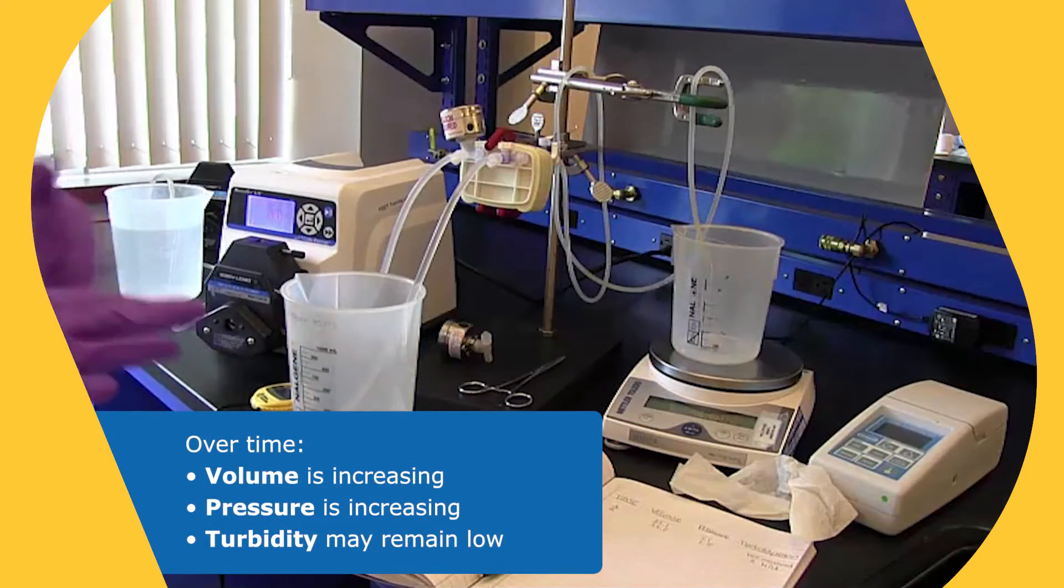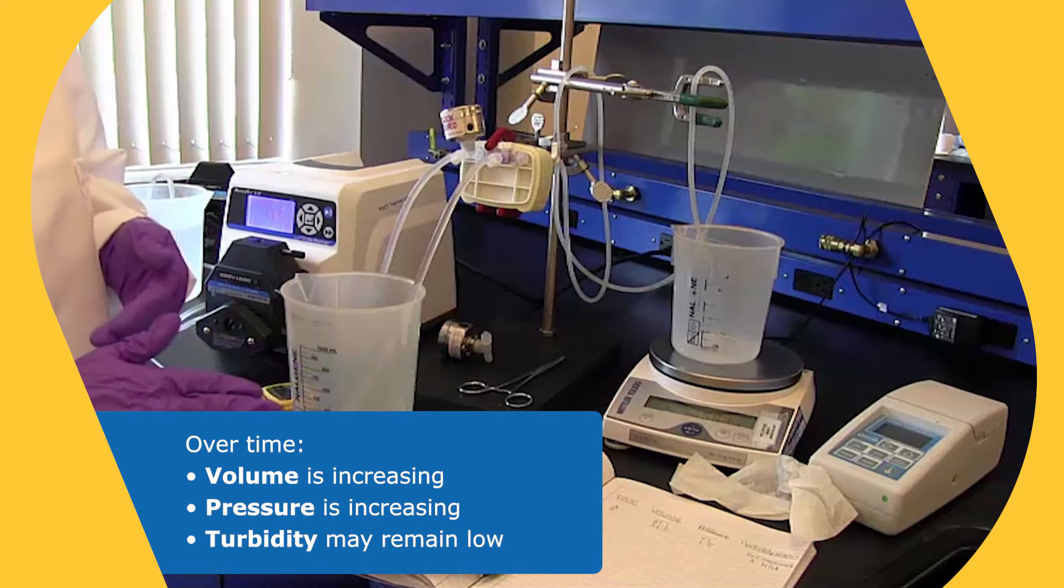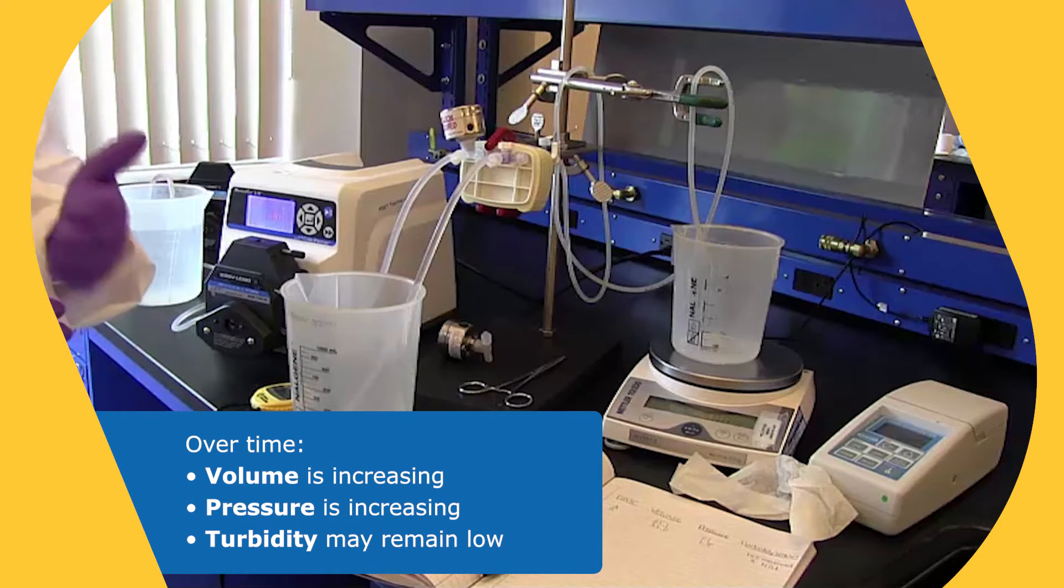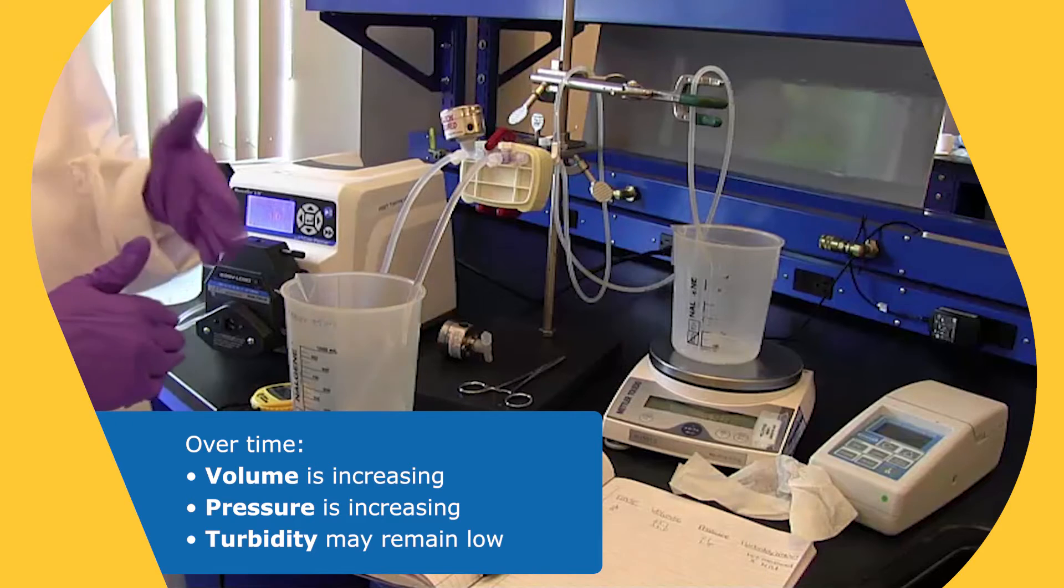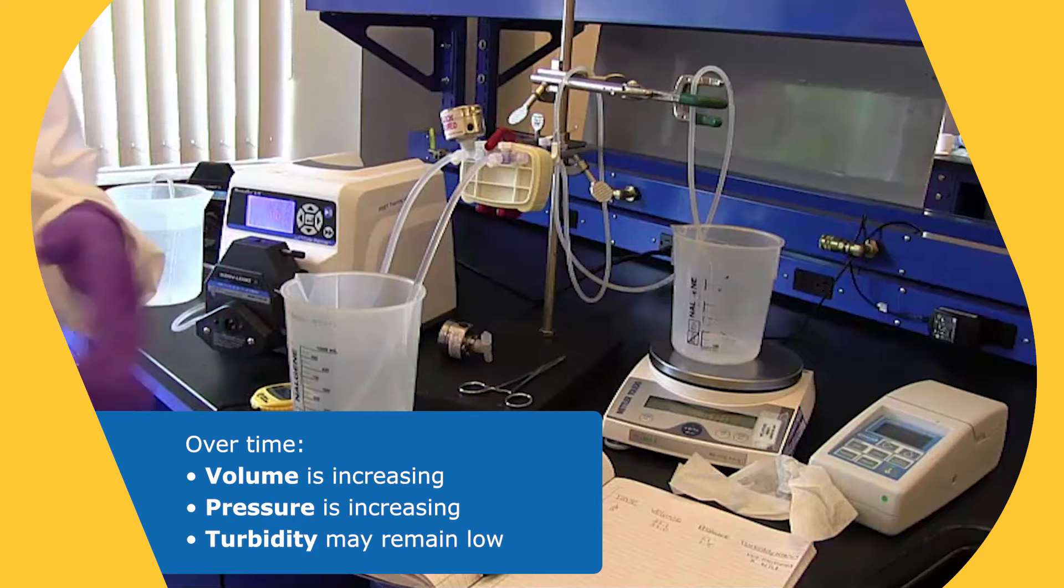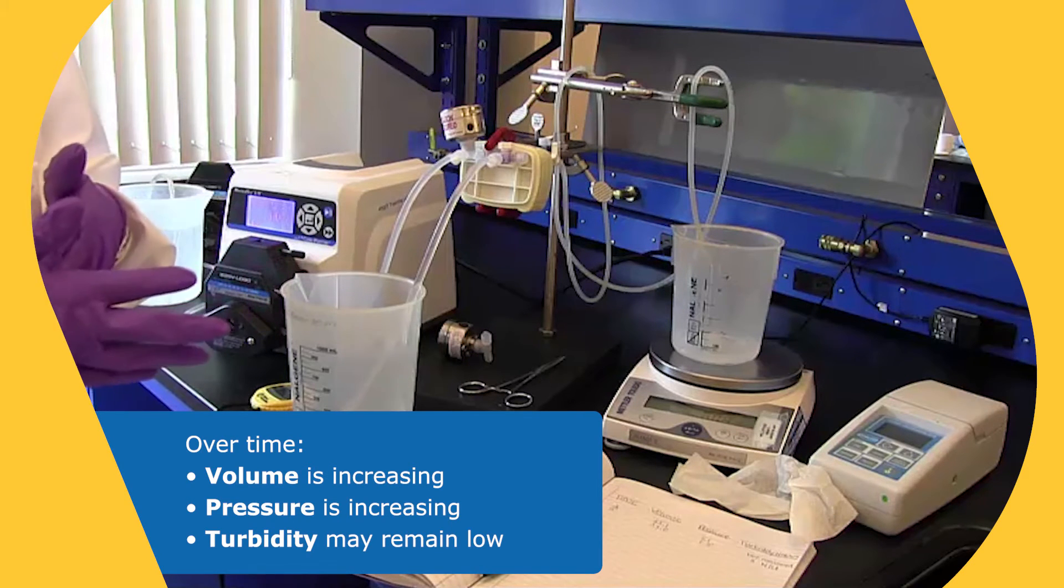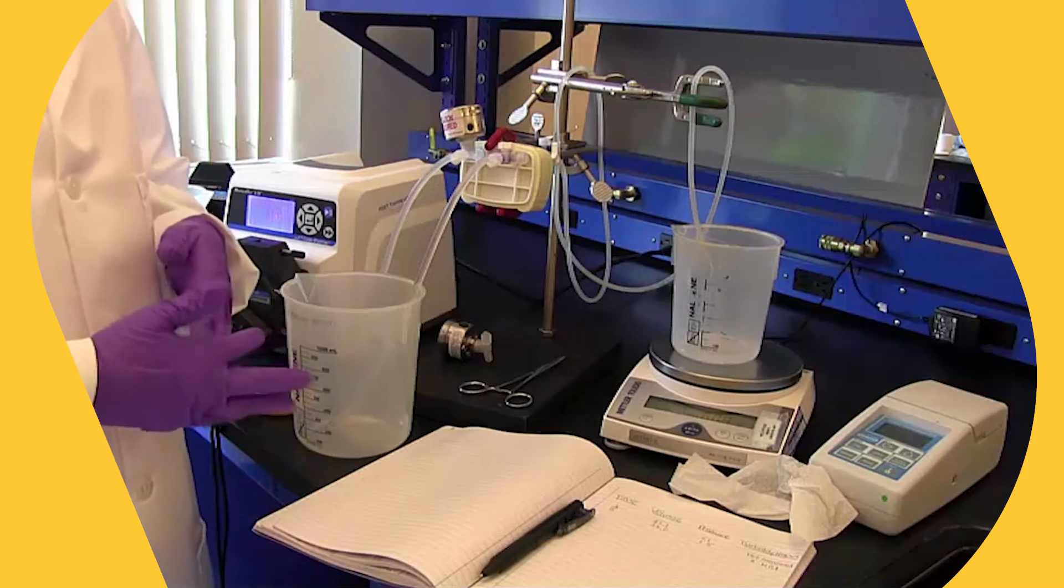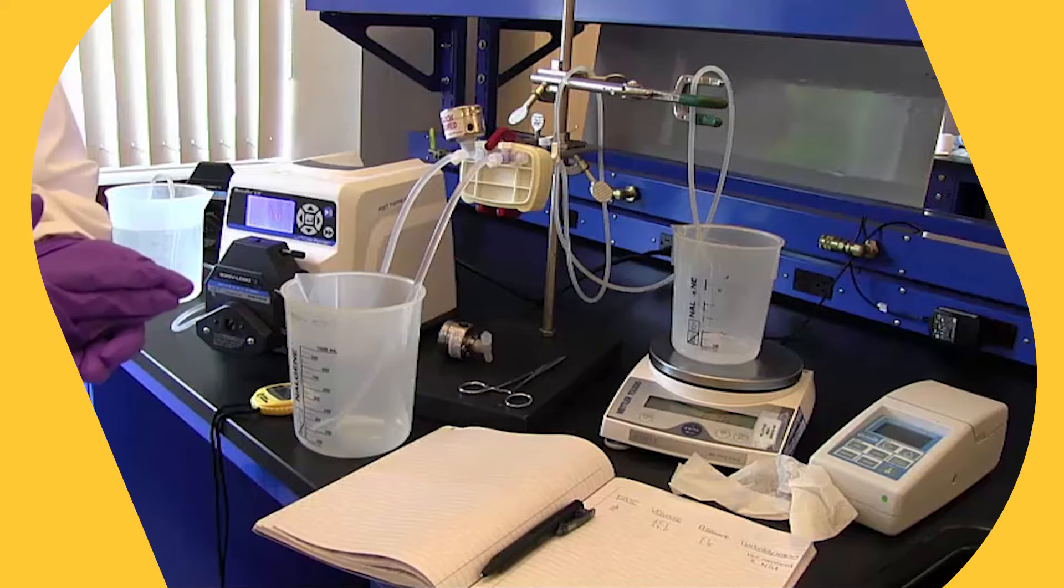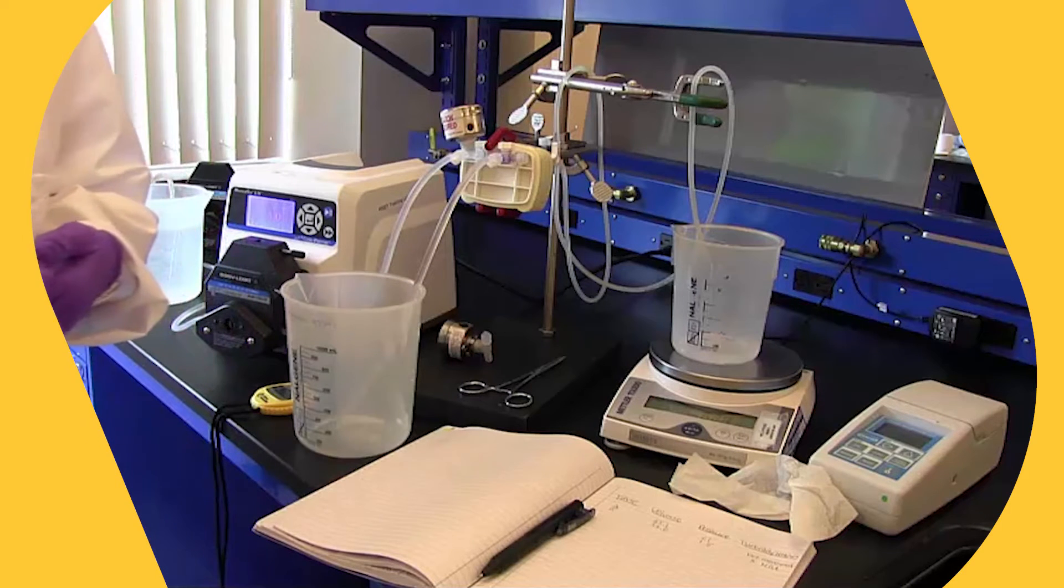So yeah, another thing to look at when you're sort of collecting the data is that when you start, you're going to expect that over time the volume is increasing, the pressure is increasing because we're just continuing to remove particles. The turbidity hopefully will stay relatively low if you've selected the right filter. So sometimes you may realize that something is not quite right there. And one of two things usually happens if it's not going to follow that increase with pressure, increase with volume, is that the pressure sort of levels off at a certain point. But what you notice when the pressure is leveling off is that the turbidity is increasing.